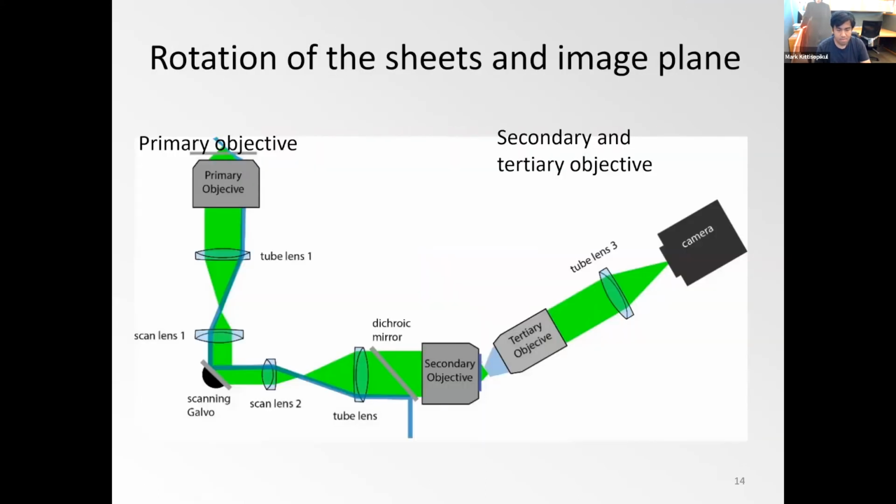All right, so I reckon this is pretty abstract. Maybe it becomes a bit more clear. So here is the optical path of the OPM. The excitation comes in and creates the oblique light sheet, or if it were a structured light sheet, there was just the second one behind, you wouldn't see it in this view.